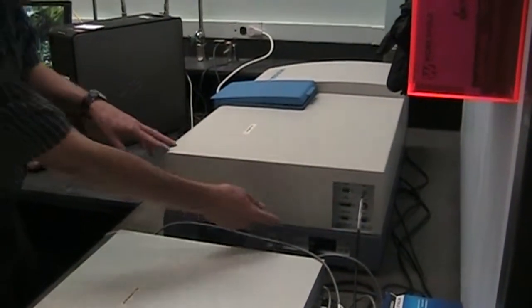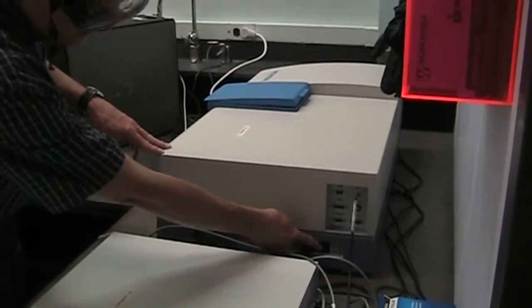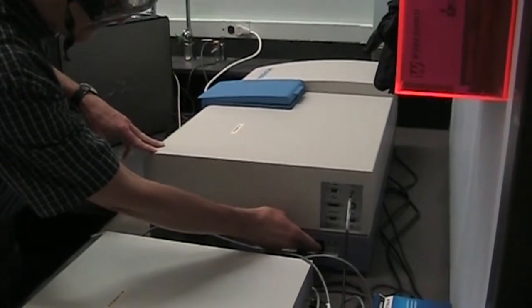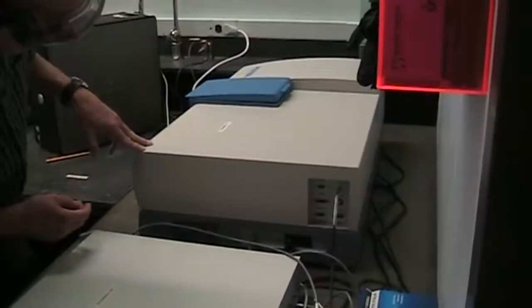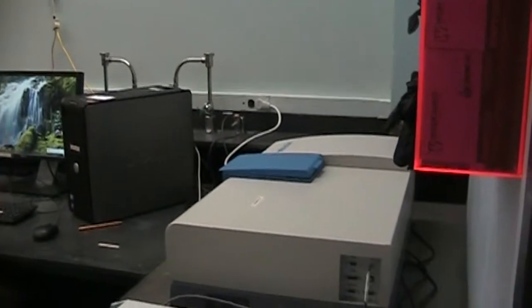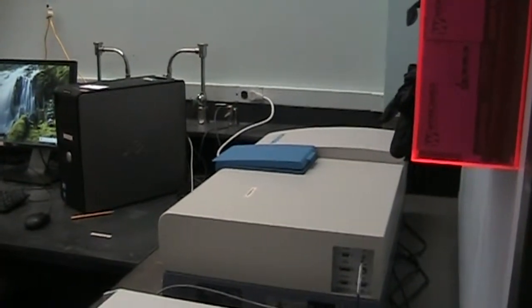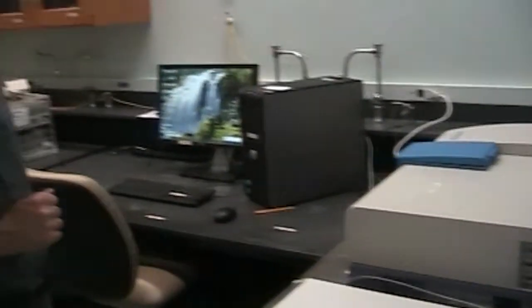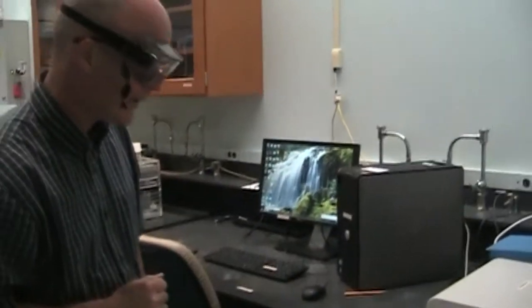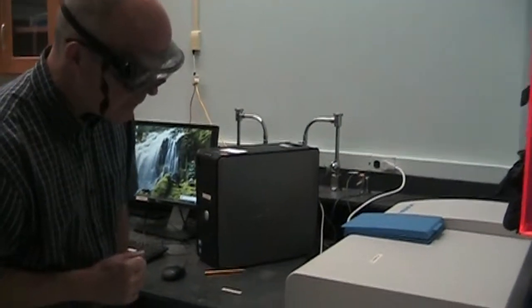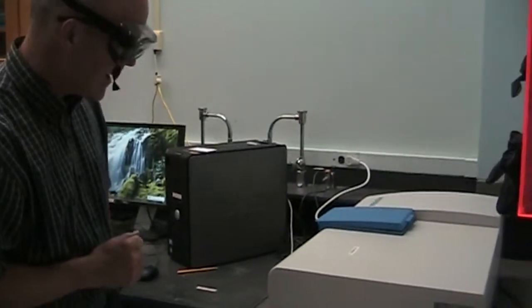So the power switch is on the right-hand side, the rocker switch back here, and we'll just flip it. After a few seconds you will hear some mechanical noises that will indicate that the instrument is turning on.